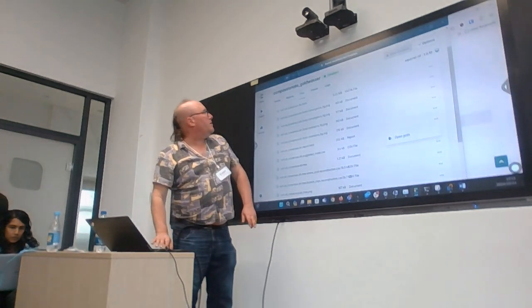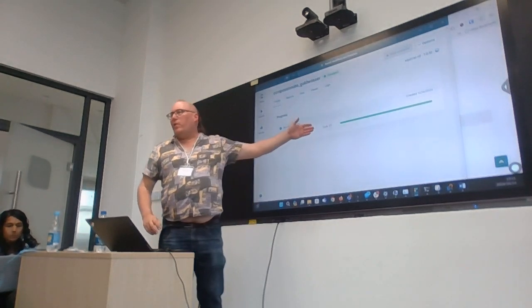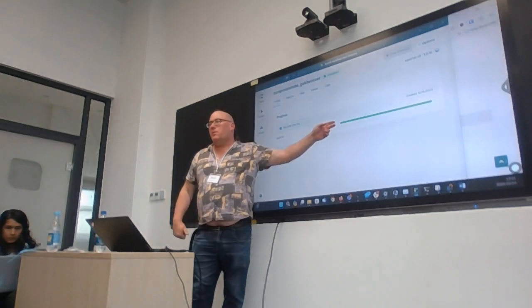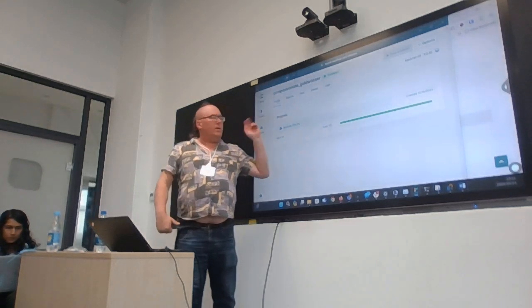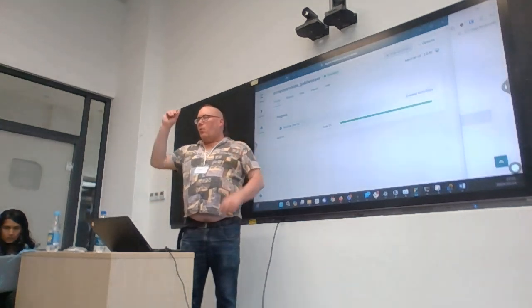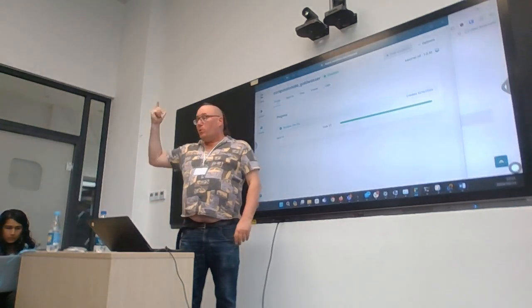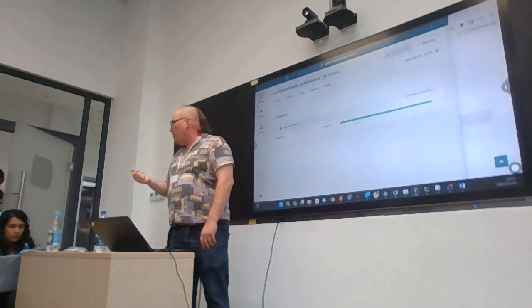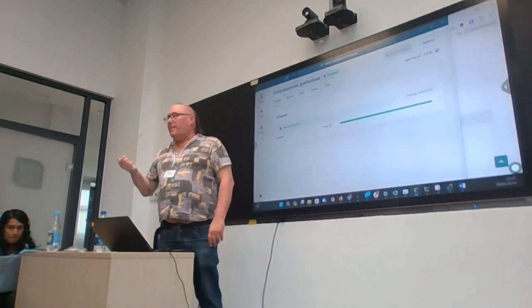Let me just go back to the details. You saw when we went for lunch, I was busy running squirrel. I'd only taken one sample. I was only running it on one sample, which I've collected from public data.